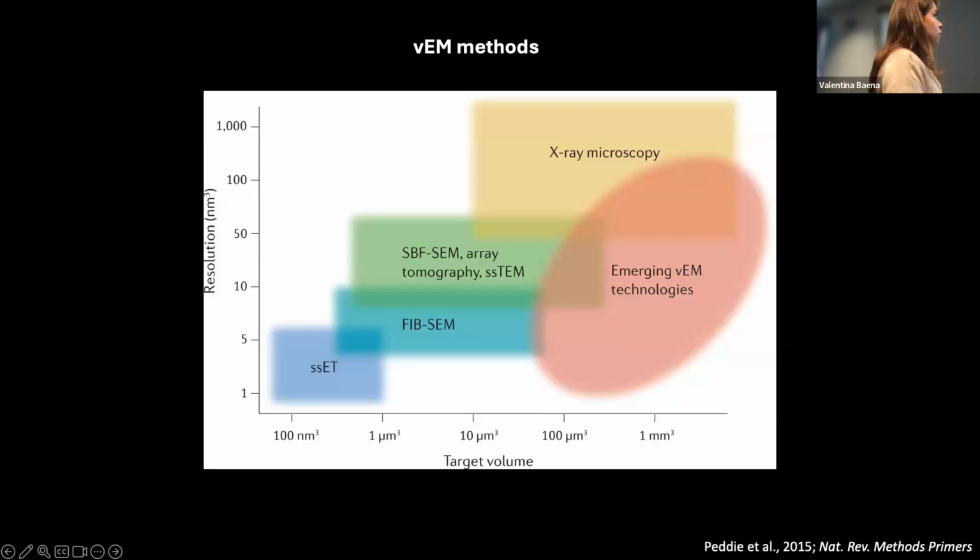Okay. So if you're not familiar with the array of volume-EM methods, you will become familiar with them over the course of these 2 days. We're probably going to touch on a lot of these, but array tomography occupies this very nice niche over here, shown in green in this beautiful review paper, which I encourage. There's probably several authors from this in the audience right now.